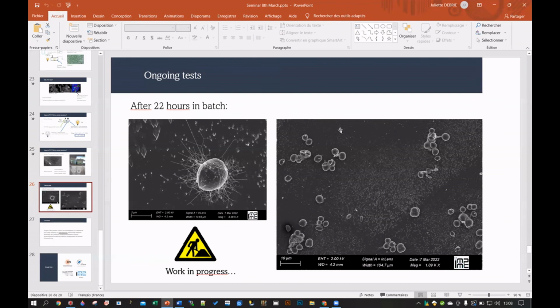You will not have cells, you will have EPS only covering everything. If the EPS binds on the reactive sites, you may expect a change in the threshold. That could be cool.